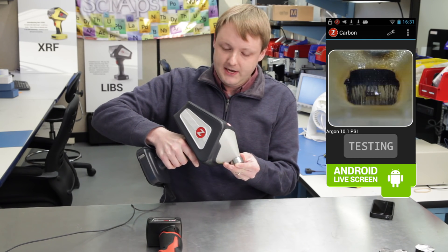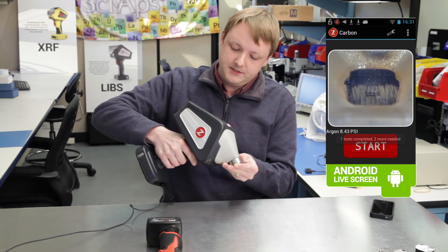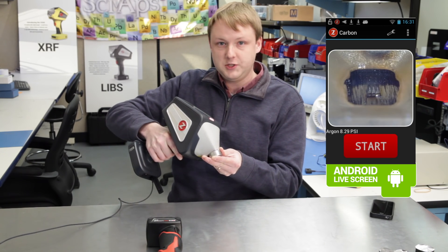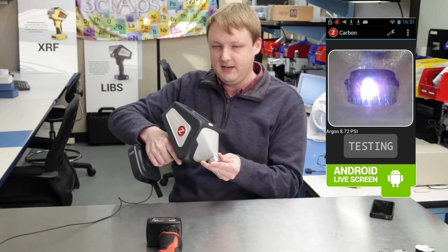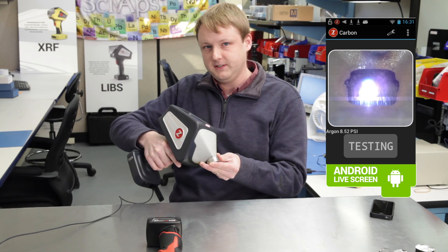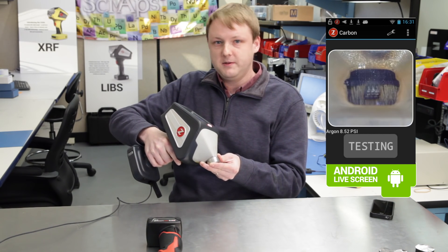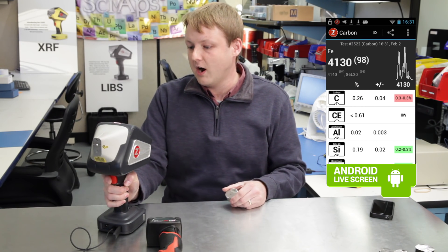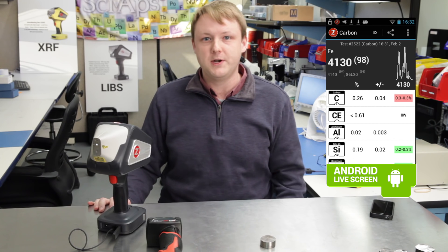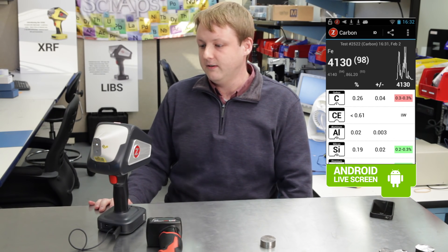4130 has about 0.3% carbon, so the analyzer is going to prompt me to test a few repeats. What the analyzer is doing is looking at each spectrum that comes in and doing some data rejection in case there happen to be any outliers or you happen to hit a spot that has some surface contamination. It's applying some statistical analysis to all the data that come in to make sure that you're only getting the most repeatable data for your carbon result. The sample shows 0.3% carbon, and we're getting a reading of 0.26 plus or minus 0.04, so 0.3 is right within that spec.